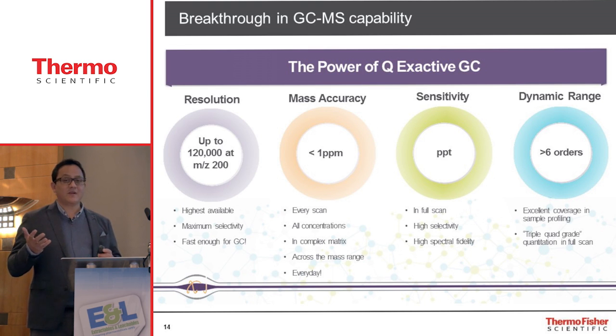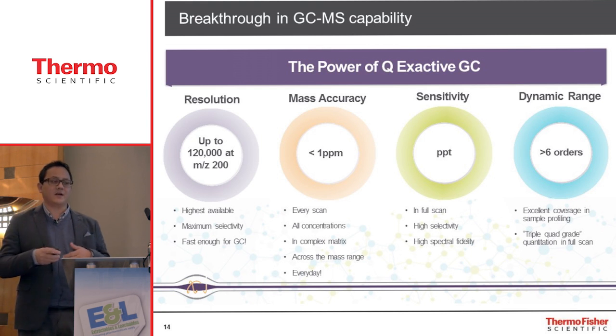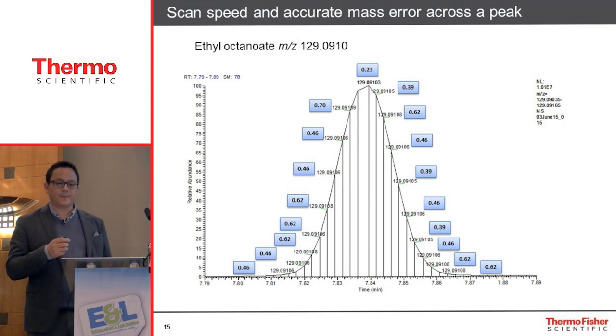What does this mean? In reality, you don't need to dilute extracts to do a quantification of a high peak, but you can still identify a tiny little trace extractable in one run, unlike on other technologies where you have to set up a more elegant and complex analytical sequence.